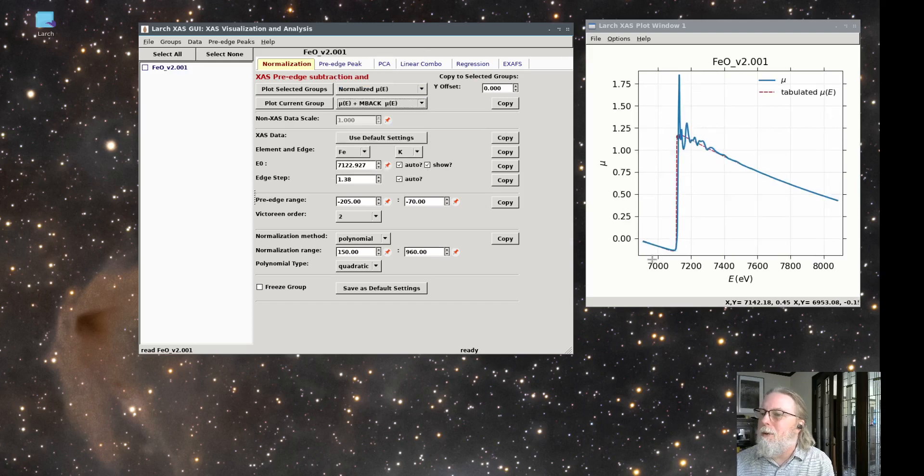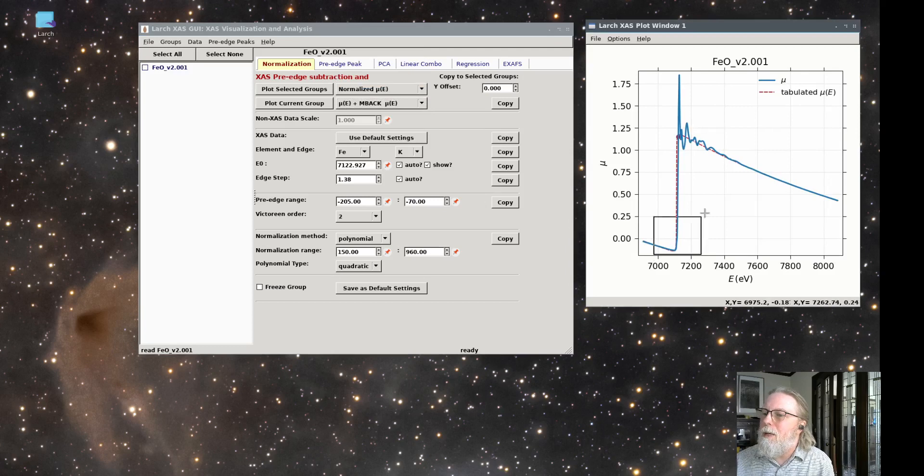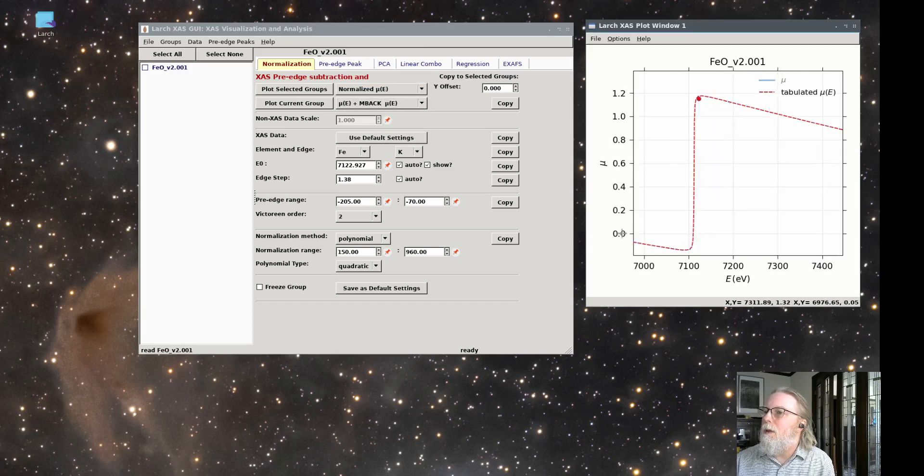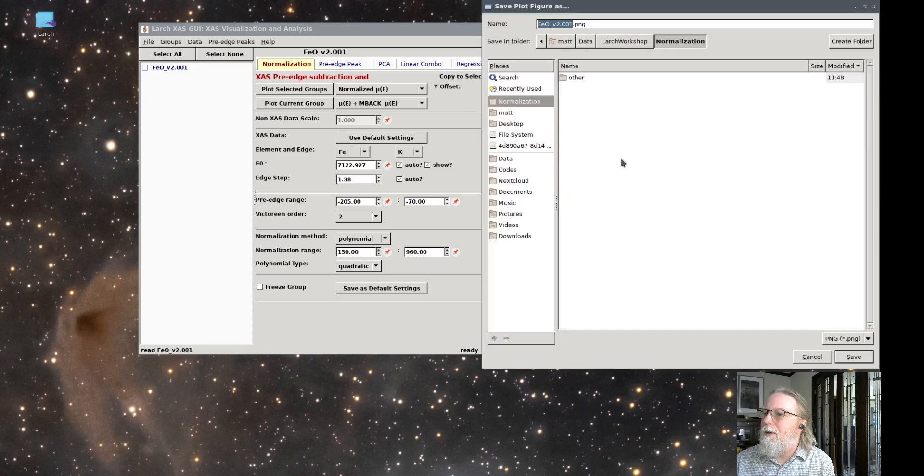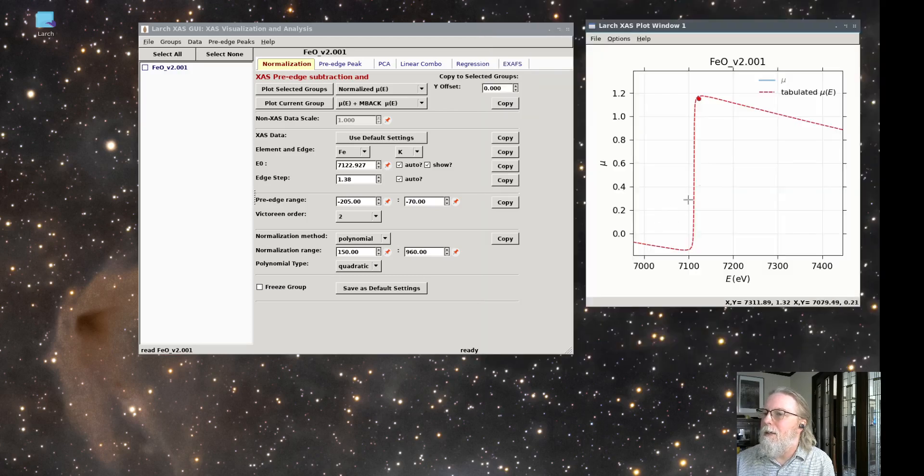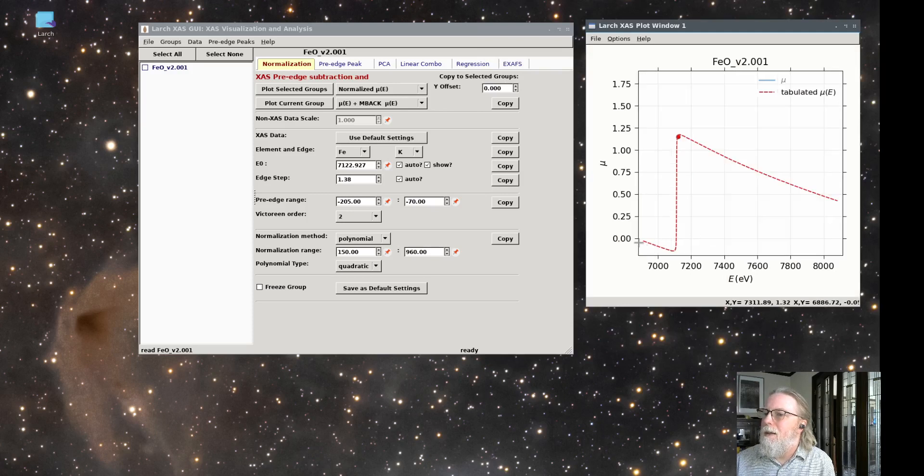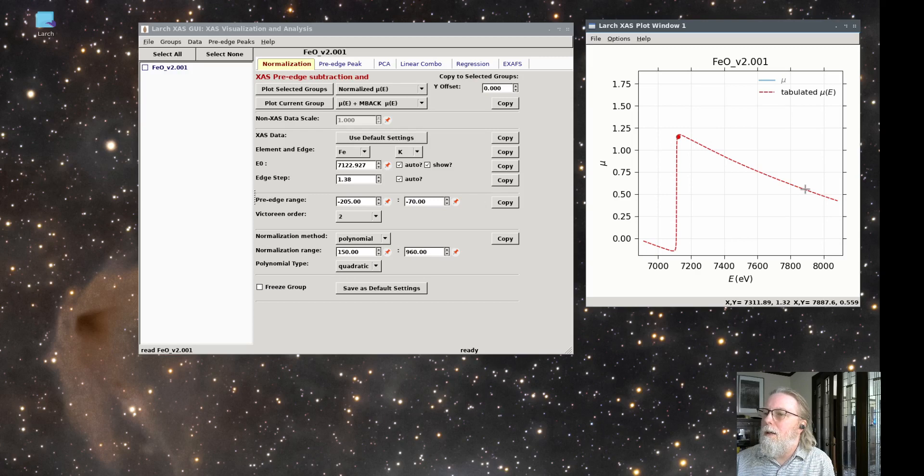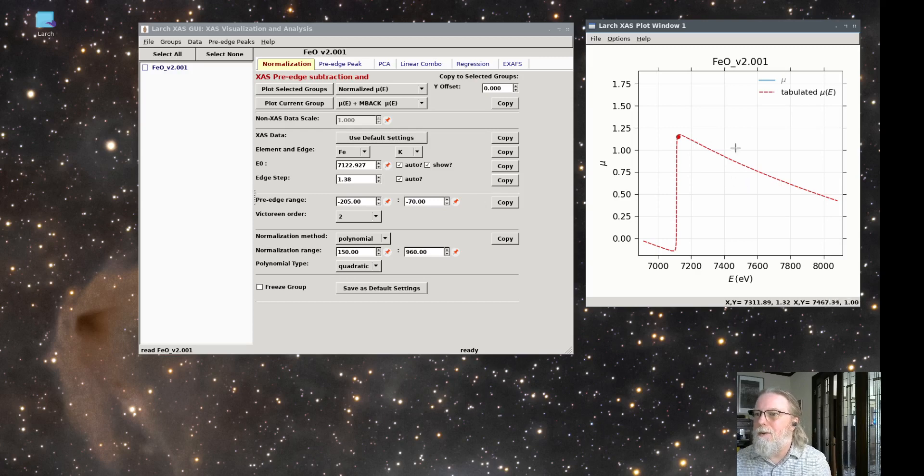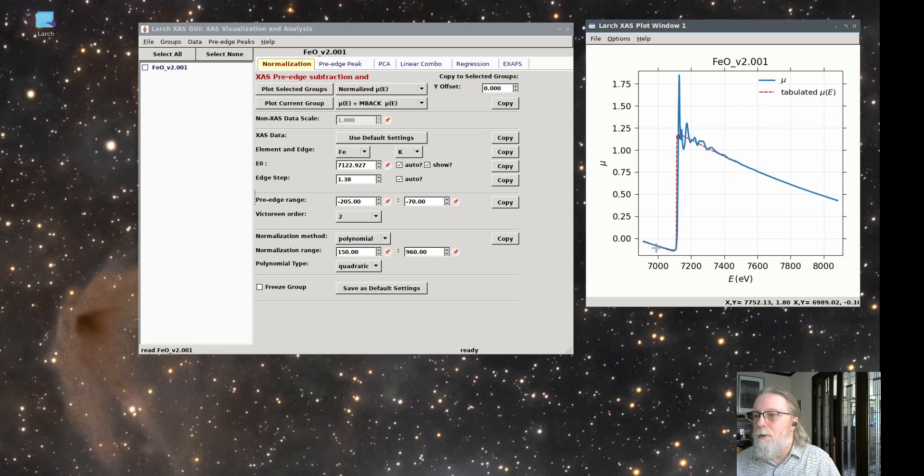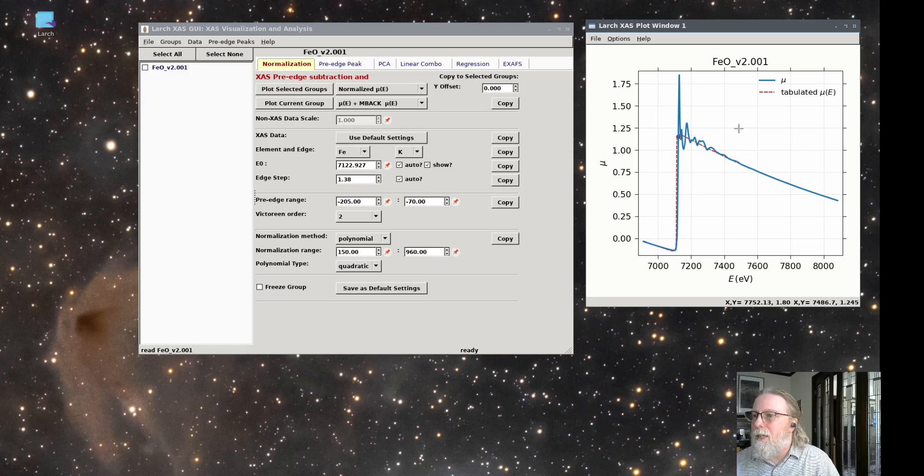And so if we compare that, let me go back here. So what it's done is taken tabulated mu of E values, which look like that, that go up all the way. I'm going to cancel. I don't want to save the image of that. I want to zoom out. That's sort of the known tabulated way that mu of E decays over a large energy range. If we put the data on top of that, it looks like that. So that's a pretty good measurement of how the data should decay and how you should think about normalization.